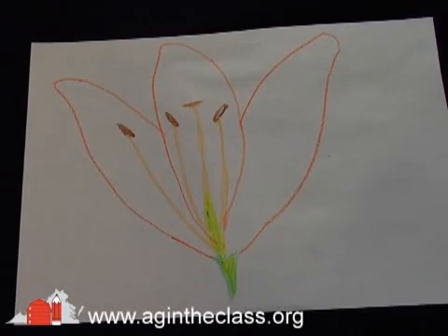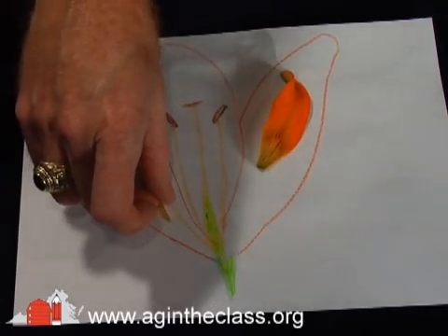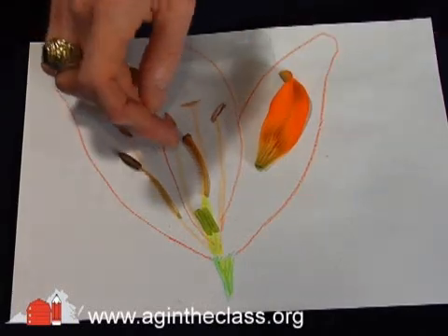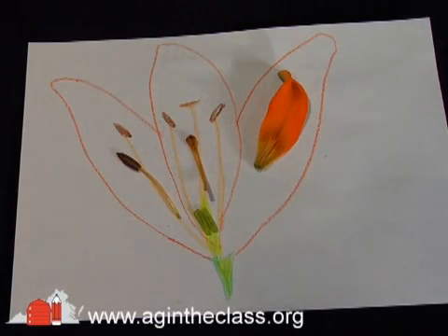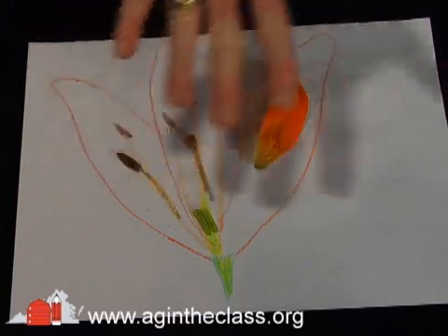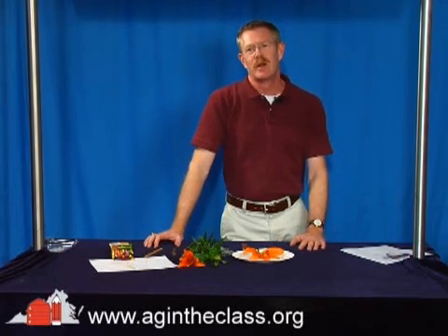Breaking the flower parts off and then actually laying them on their drawing — like so. Putting the petal with the petal, just sort of matching things up. Putting the stamens with the stamens, and then coming back with the pistil and laying that in there as well, showing all of those parts from the flower with their drawing. You can take the entire flower apart and lay all of those individual parts in there — one petal, one stamen, and so forth. For more information about this lesson and other garden lessons, please check our website.